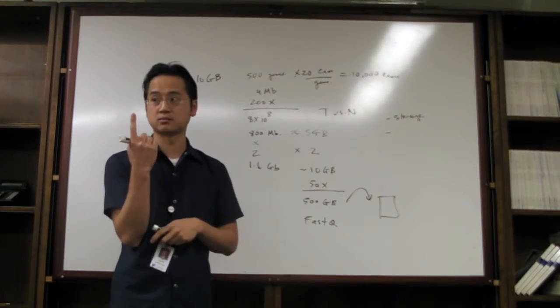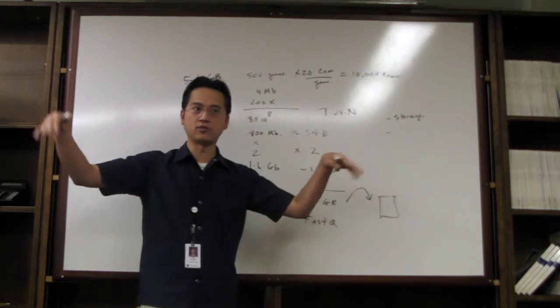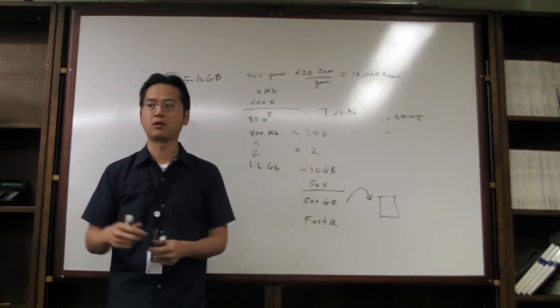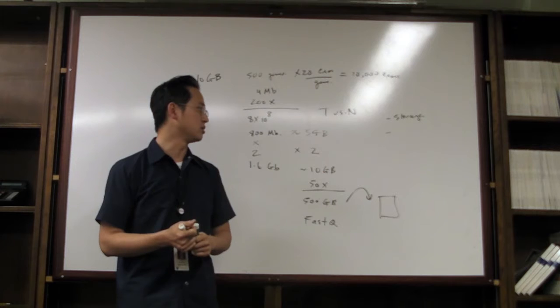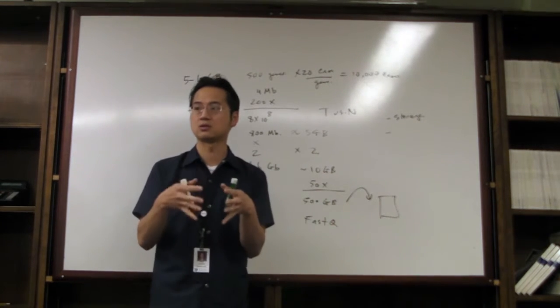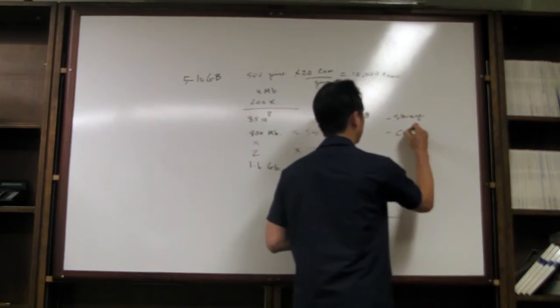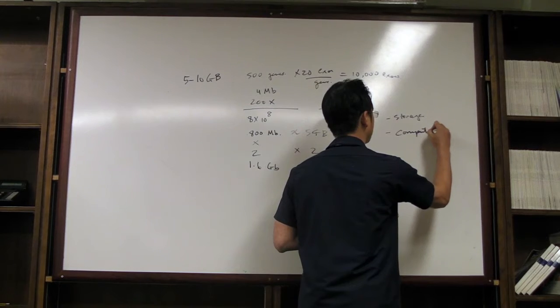And that's one case, by the way. So if you had 50 of these cases, you would need about 50 of those computers running, right? All in parallel at the same time. So the solution is not to have 50 computers running. The solution is to make your computers denser with processing power. And that's why you need a cluster. So computing is another problem in terms of NGS analysis.